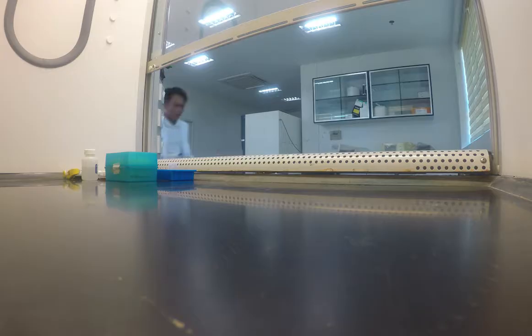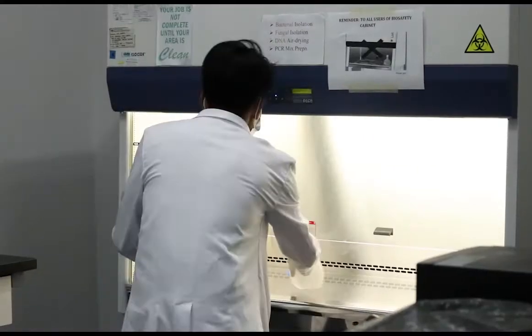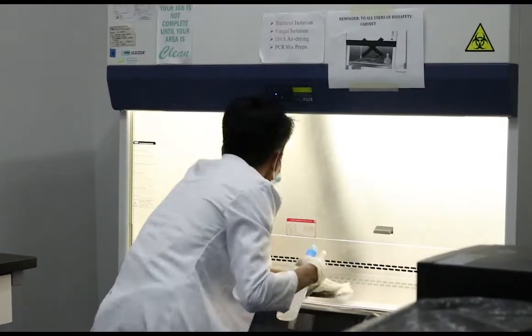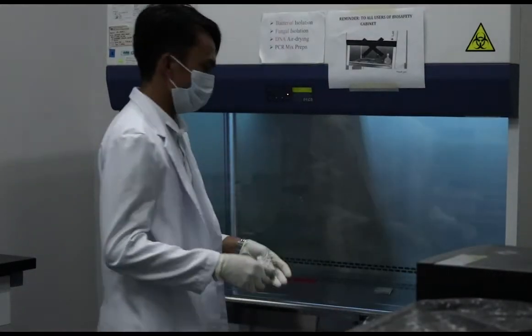Disinfection. Cleaning a biosafety cabinet is an important function in terms of both containment and sterility. Aseptic technique and daily decontamination should eliminate the majority of contaminants.